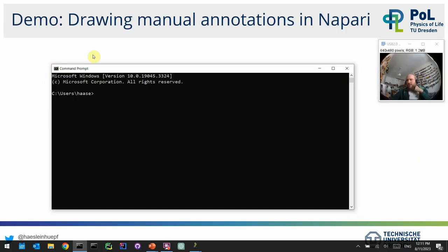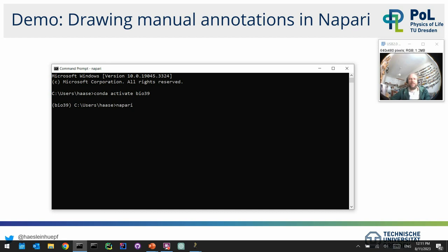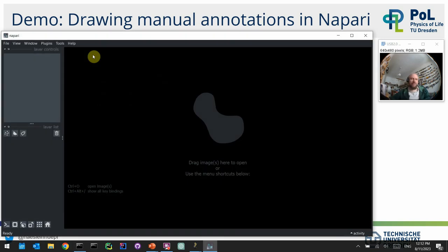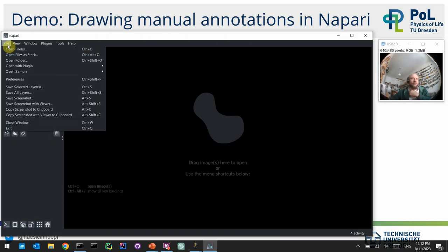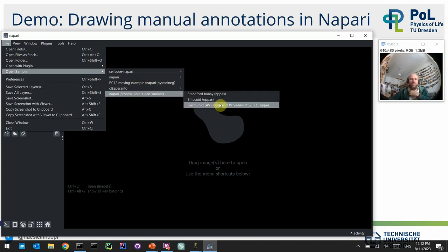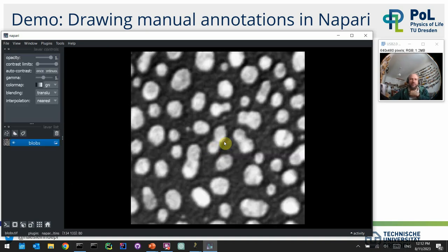To start Napari, you typically start from the terminal by first activating a conda environment with `conda activate` — in my case the environment is called a specific name, but on your computer it might be different. Then you enter `napari` to start Napari from the terminal. It's very common to start it this way. Then Napari will open, and you can load an example image from the menu — for instance, the blobs image.